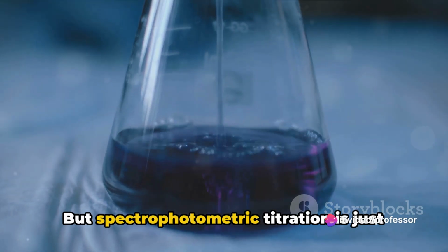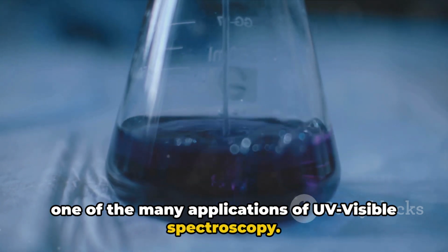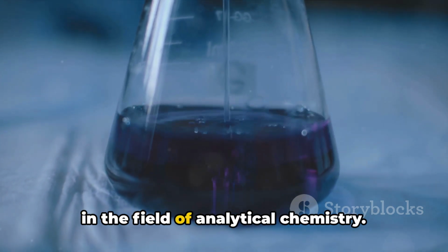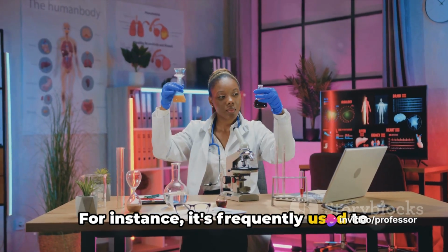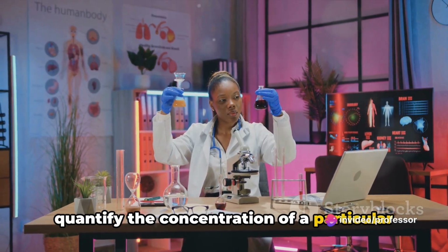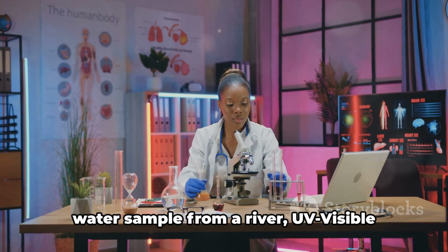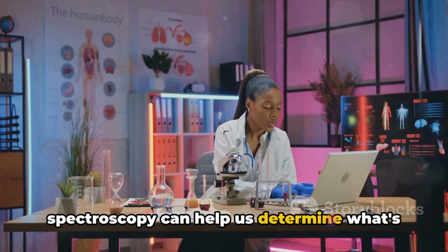But spectrophotometric titration is just one of the many applications of UV visible spectroscopy. This technique also finds extensive use in the field of analytical chemistry. For instance, it's frequently used to quantify the concentration of a particular substance in a mixture. Whether it's a pharmaceutical sample or a water sample from a river, UV visible spectroscopy can help us determine what's in there.